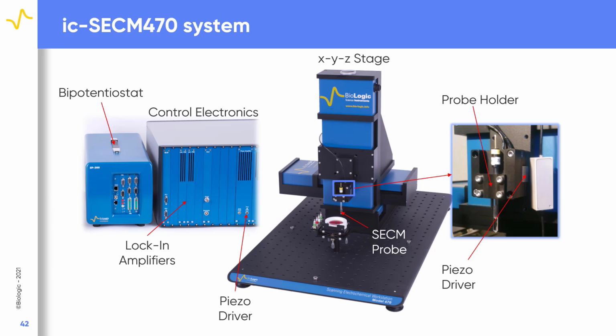It also performs fine probe positioning when the probe is in intermittent contact with the surface. The use of the strain gauge sensor in combination with the piezo allows the accurate measurement of the change in vibration of the probe, which is required to maintain the probe to sample distance.